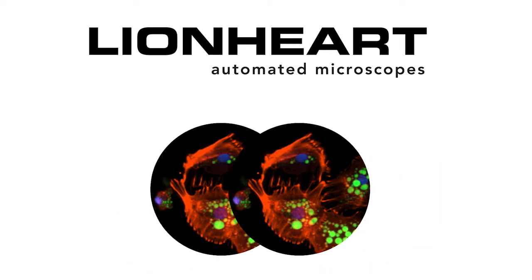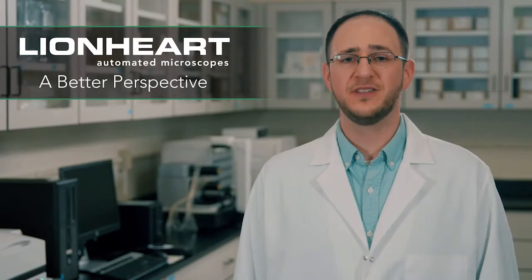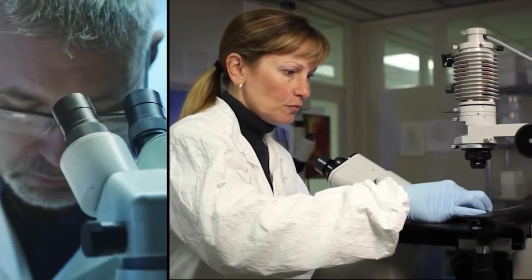Let's take a new look at microscopy from a fresh perspective, a better perspective. With the Lionheart Automated Microscope and Gen 5 software, it's easier than ever to capture high-quality images and run powerful analysis. Traditional microscopy is powerful, but can be challenging.